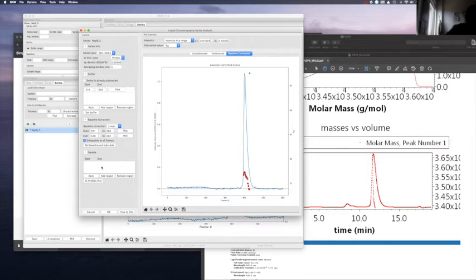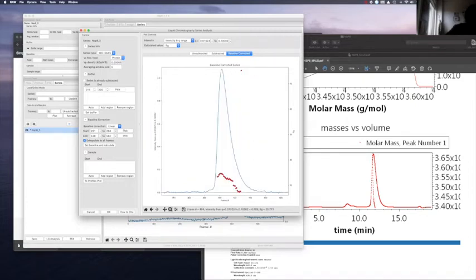The next step will be to add the region for the sample, and that's very important. Okay, to zoom in, and before I go there and select the peak, this is very informative as well. You already see that not only is the molecular weight dropping across the peak, but also the radius of gyration, about 32 to 24, sorry for the last outlier here.